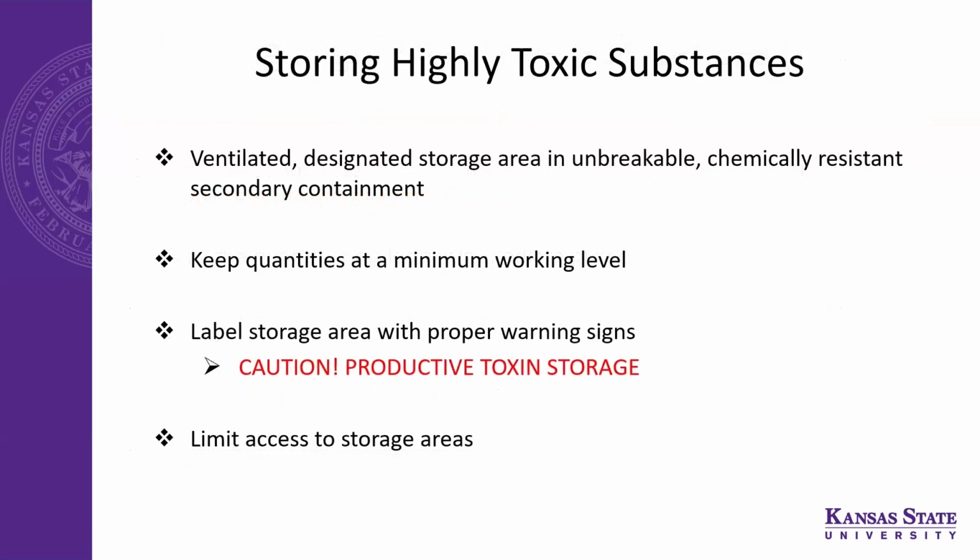Then storage of highly toxic substances: again, they should be in a ventilated, designated storage area, in unbreakable, chemically resistant secondary containers. Keep quantities at a minimum working level. Again, have a sign saying caution, toxin storage. Limit access to the storage area, similar to the highly reactive chemicals.